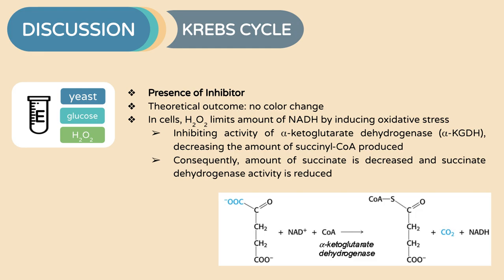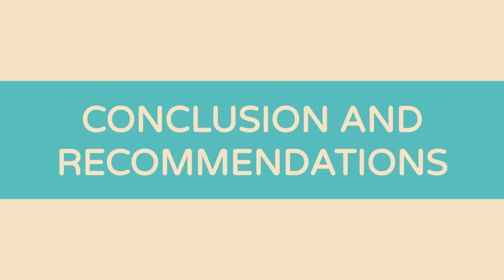However, it was observed that test tube E turned into a lighter blue color, which indicates that the metabolic processes are not completely stopped. Conclusion and recommendation.